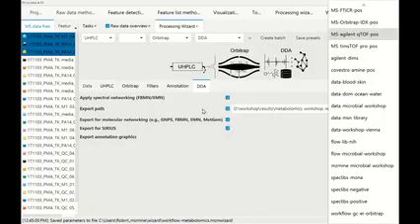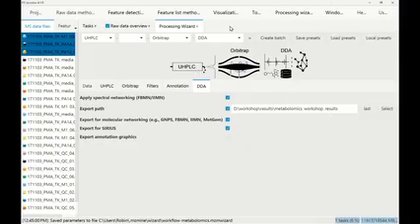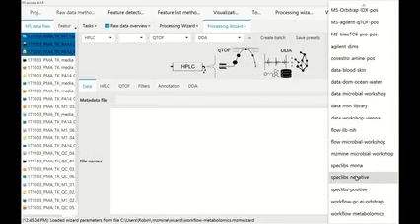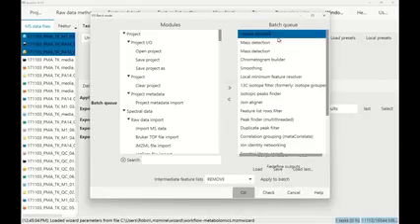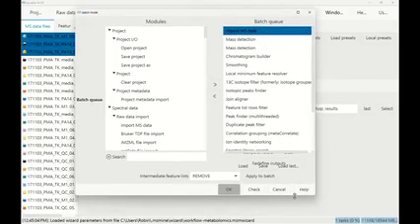And then next time when we open the processing wizard, it's actually going to show up here on the bottom. Workflow, metabolomics. And also if you restart MZmine, it's going to be very easy for your group even, like for the whole group, to create presets and then say, okay, this is my HPLC method, this is my GC method, and then my QTOF, my Orbitrap, and we just mix them together. Yeah. And so from here, create batch, and you're going to see this from MZmine 2 even.